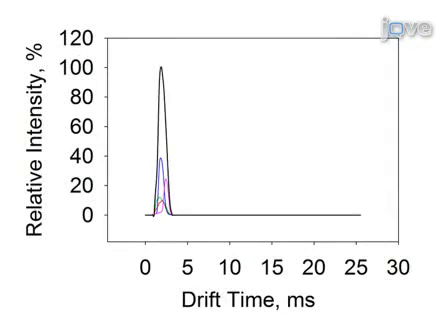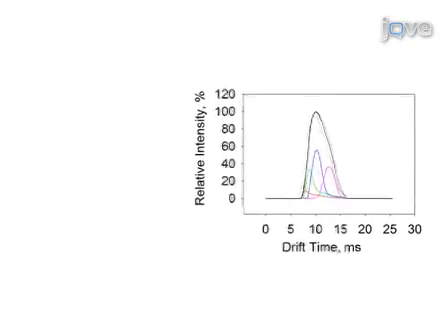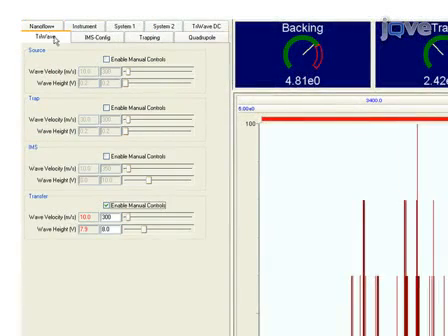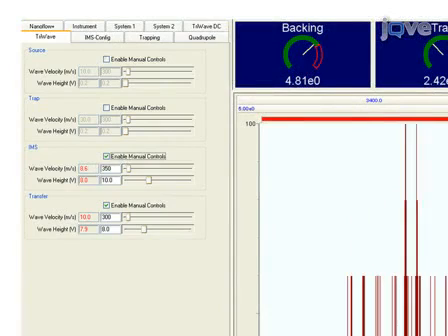Once an optimum mass spectrum is obtained, the drift time or IM profile should be adjusted. When analyzing protein assemblies, optimal conditions for both mass and mobility measurements are often incompatible. Therefore, it is important to strike the proper balance between the two. Overall, the ion mobility plot should be optimized such that the peaks are distributed over the entire drift time range, and the peak profile is smooth, approaching a Gaussian distribution. Significant peak asymmetry can be related to poor separation of multiple conformations.